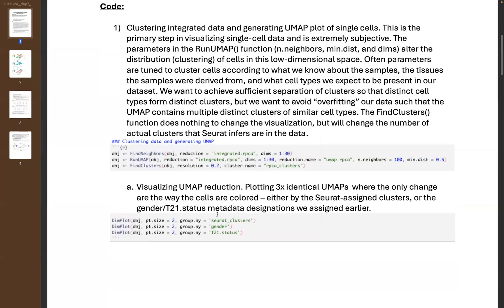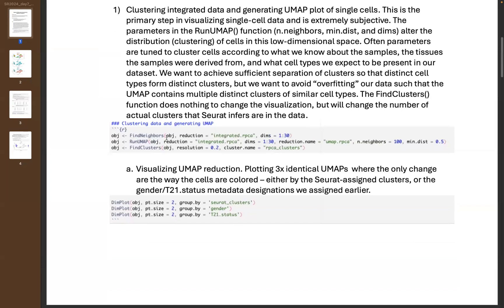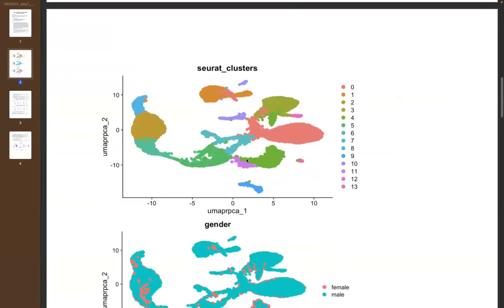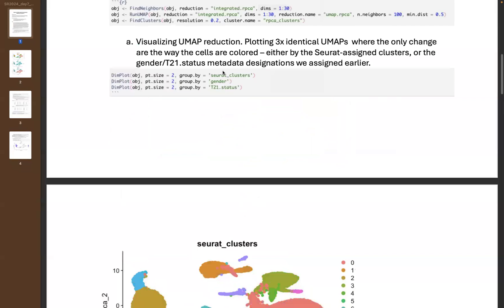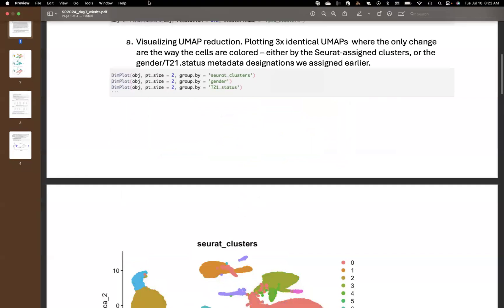When we want to plot the results from these three functions, we use DimPlot. We can change the point size, and we can change the group-by parameter. This is where the metadata we added to the Seurat objects really comes into play — we can color the cells based on different metadata designations. Each point is an individual cell, segregated into clusters, and those clusters are shaped based on the n_neighbors and minimum distance parameters.